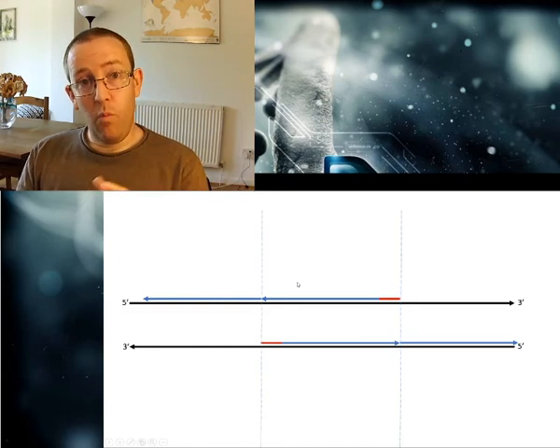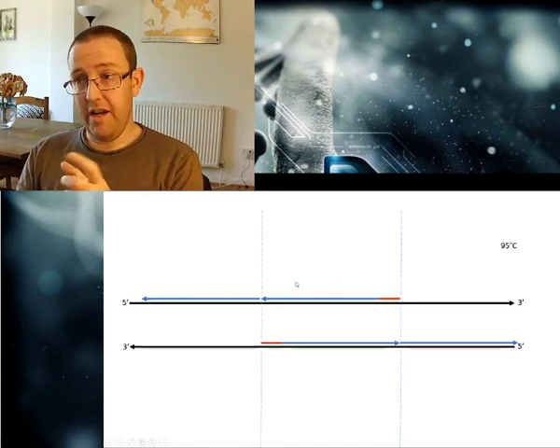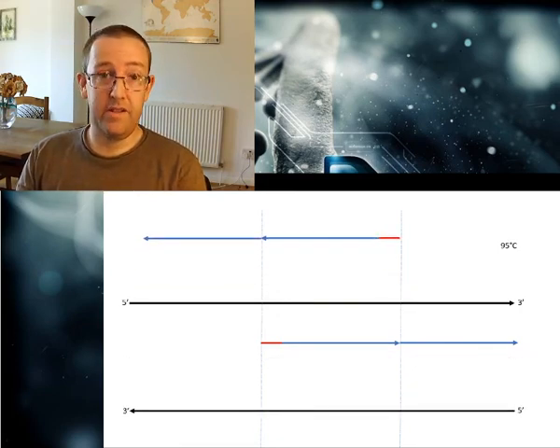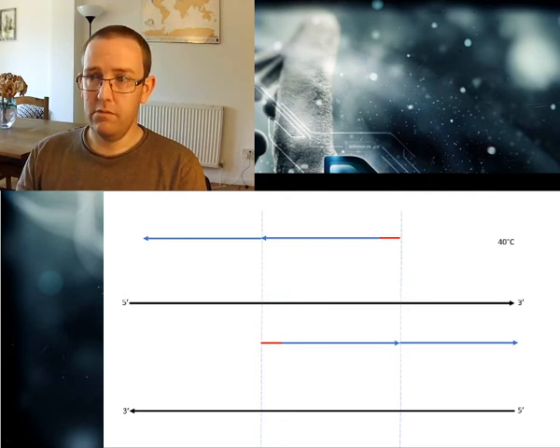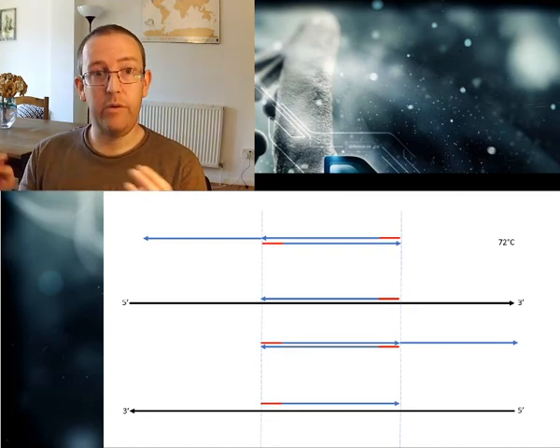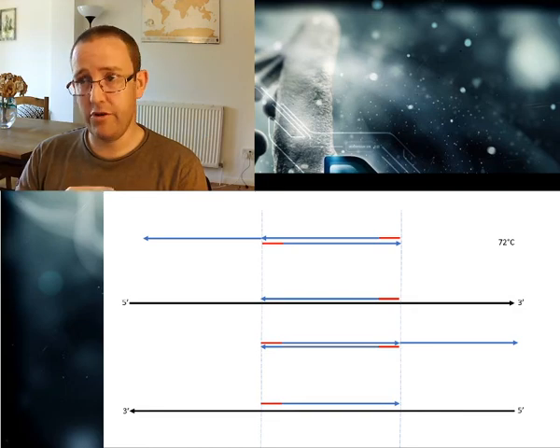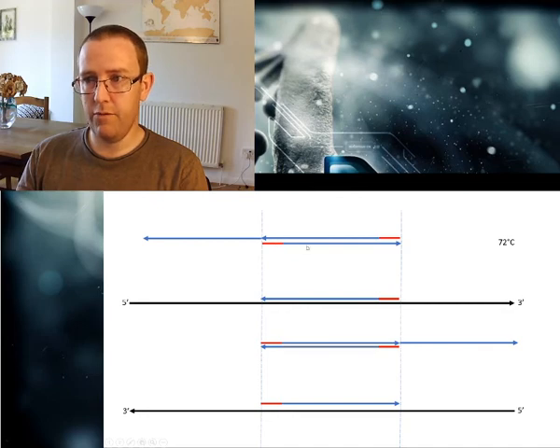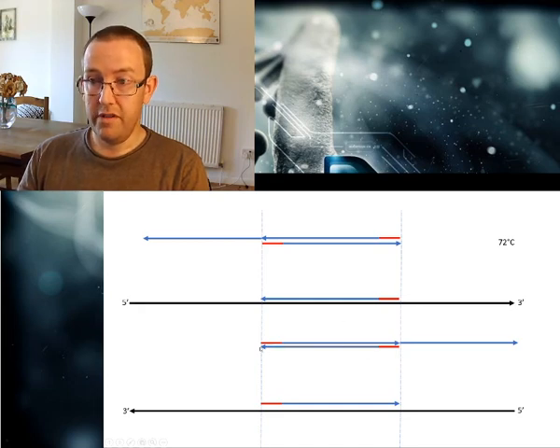Now, to understand why you only end up with that particular chunk of DNA, you have to go into the next generation, because in the next generation, when these things get split up again and the primers anneal and your extension happens, because the strands are anti-parallel, in each generation you're going to be going in a different direction. As you can see up here, this strand that's being formed does reach a hard end. It reaches the original primer, and then the DNA polymerase doesn't have anything to copy, so it literally just drops off. The same is true down here, where it literally just drops off.